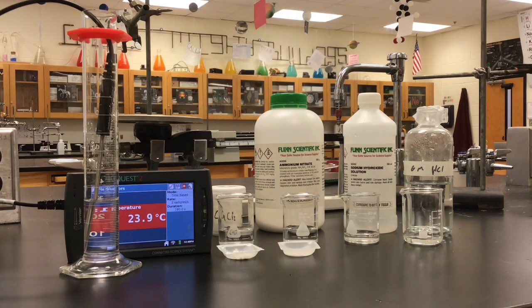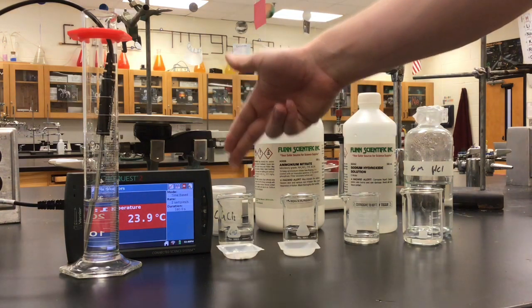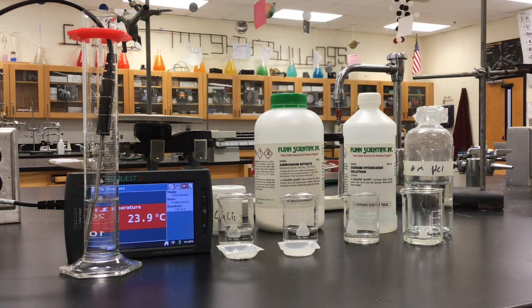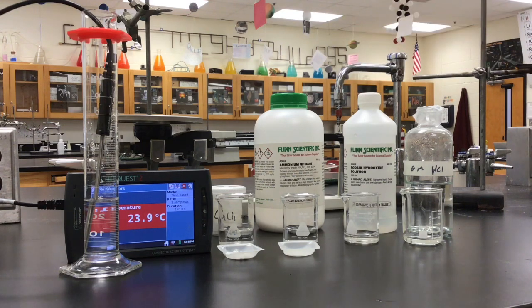Hello Chemistry, this is the video that goes along with Lab 27, Exo or Endo. We're going to take a look at three different reactions. First off, we're going to dissolve calcium chloride into water. Then we're going to dissolve ammonium nitrate into water. And then we're going to mix sodium hydroxide, which is a base, and hydrochloric acid, which is an acid, obviously. And we're going to monitor the temperature change of these reactions.